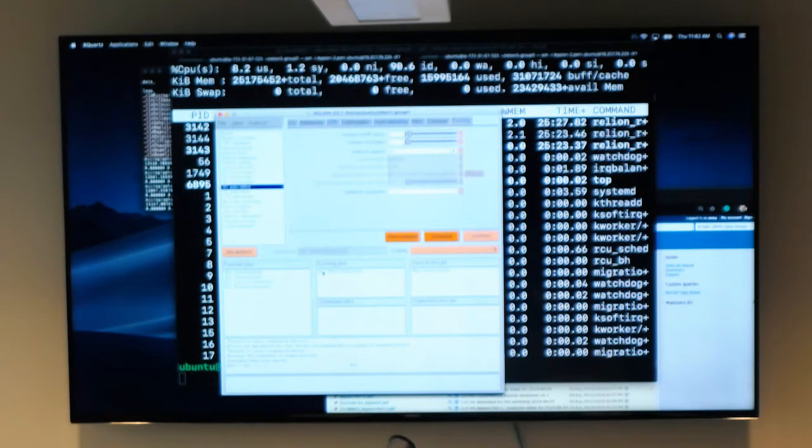I'm running it because I just want to get an estimate of how long certain steps take. So if you don't get as far, I don't expect you to. But if you do get further, then that's great.